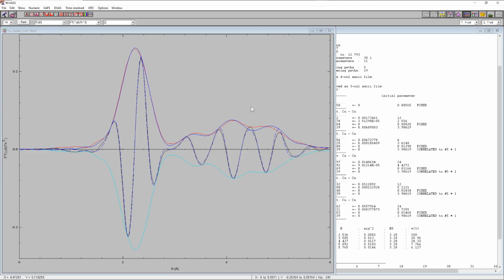With reduction in symmetry, we will get more distances. The first shell will, for oxides, for instance, in many cases consist of more than one metal-oxygen distance, and that, of course, makes the EXAFS simulation and refinement more difficult. Those are examples that we are going to look into in future tutorials.